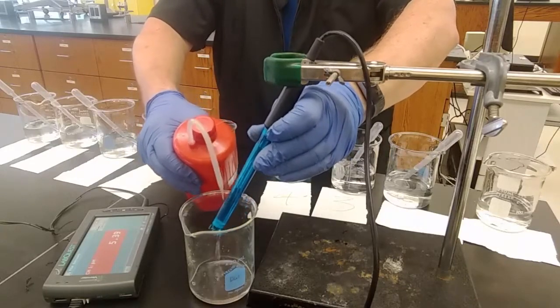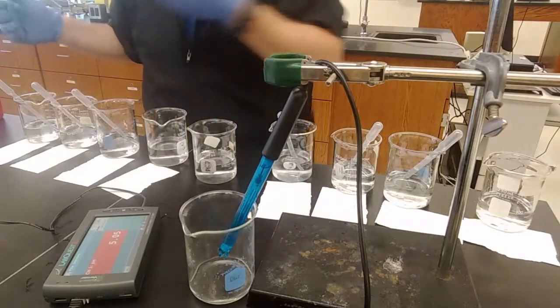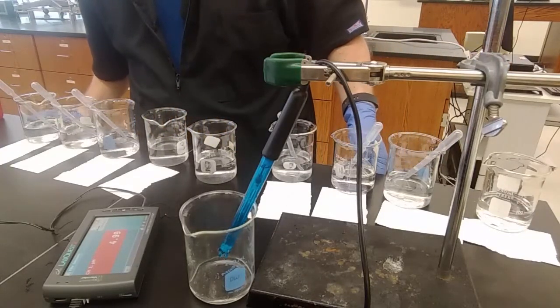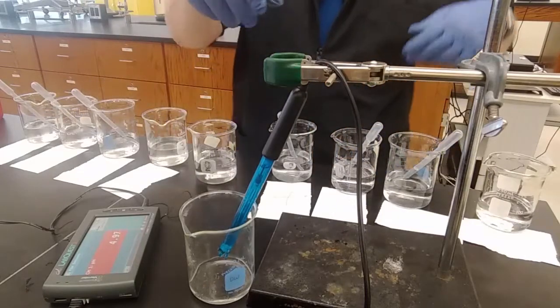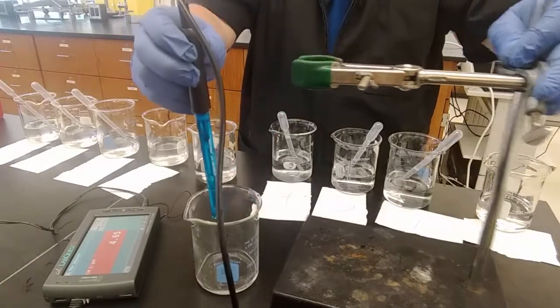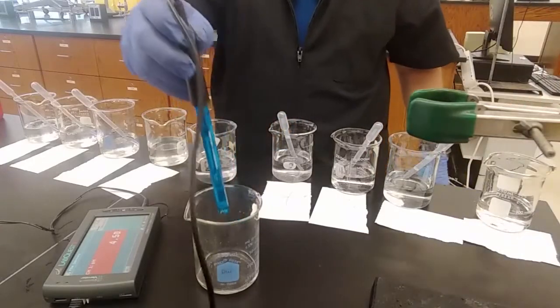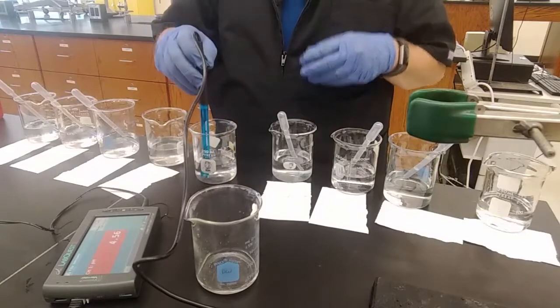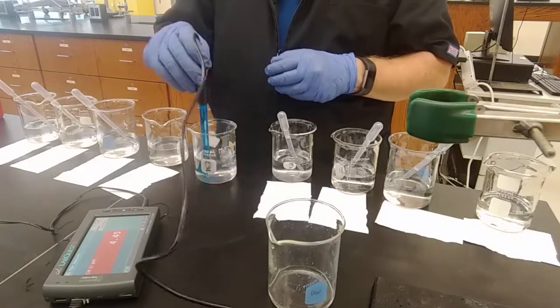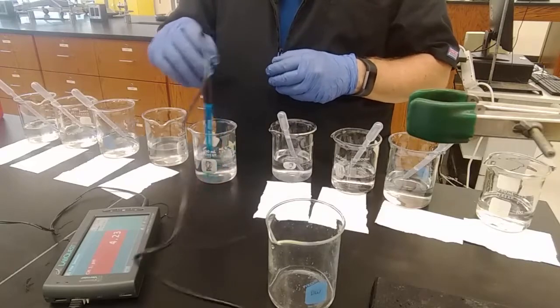Okay? So, let's measure our various solutions, 0 to 14, and see the pH value that we get in each one. So, here we go. Data sheets at the ready. We will measure the pH first. Let's start in the middle. Let's start with pH 7 and see if our water that we used to make all of our solutions is in fact pH 7, or if our meter has not been calibrated properly, or what exactly is going on.